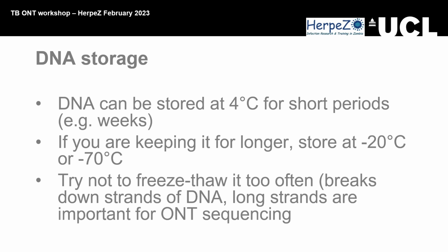I heard you mentioned the protocol you're trying to develop that combines CTAB with spin column methods. Have you yet to publish it? So it's something that Nanopore have been developing. I can't talk too much about it because it's still in development. Okay. We are the first people that they have given the protocol to test.